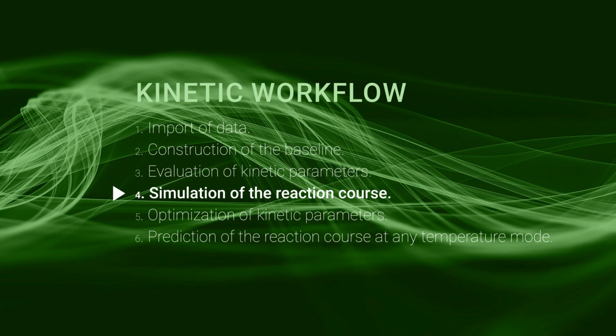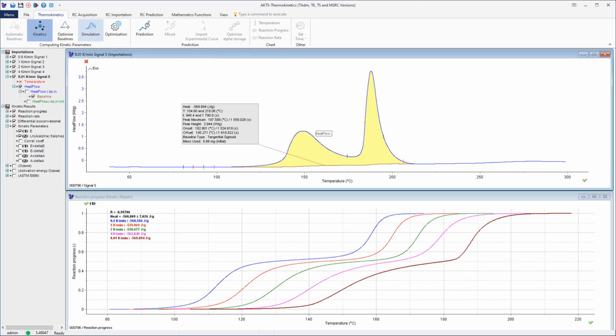Simulation of the reaction course. After baseline optimization, the new kinetic parameters are calculated and used to simulate the reaction progress for all measured heating rates. The simulation procedure starts after choosing the tool, Simulation.